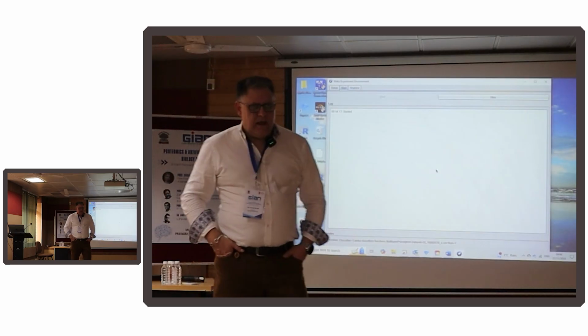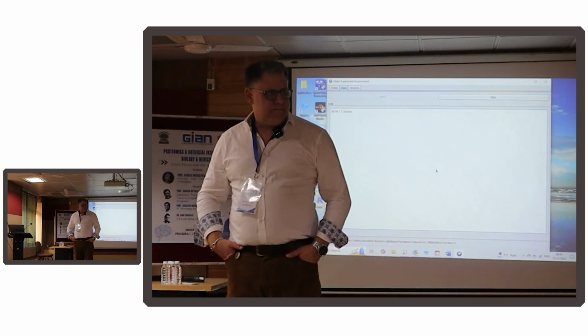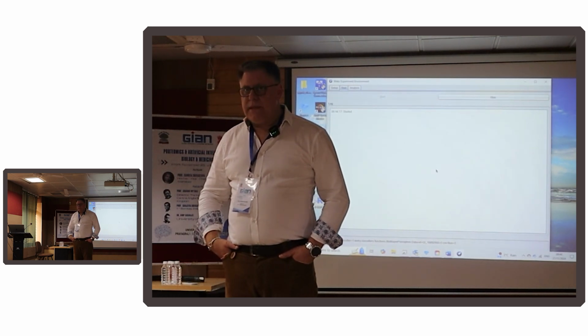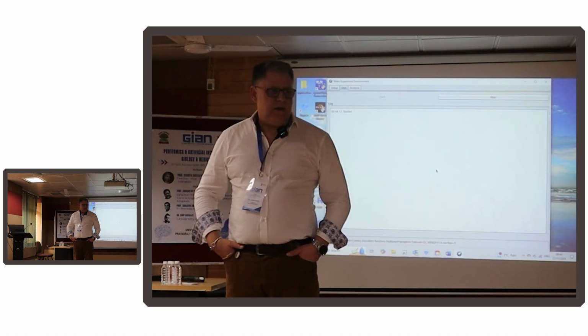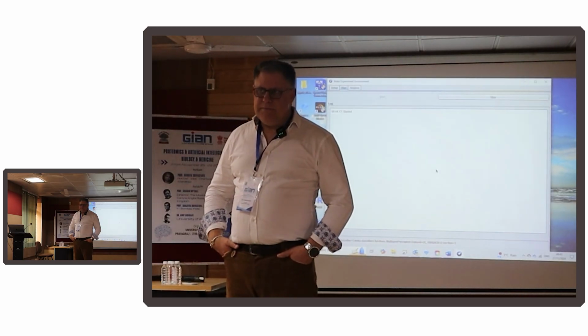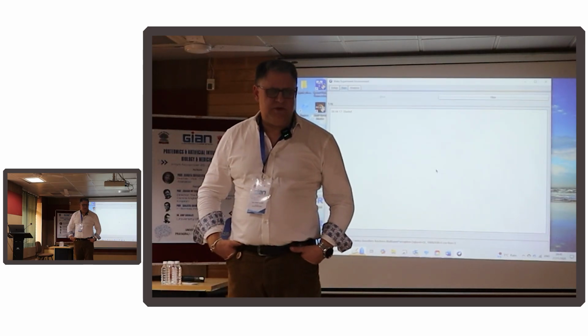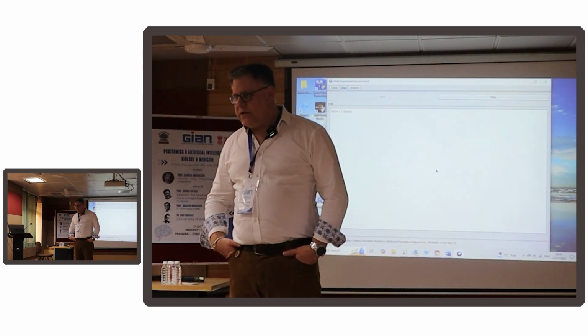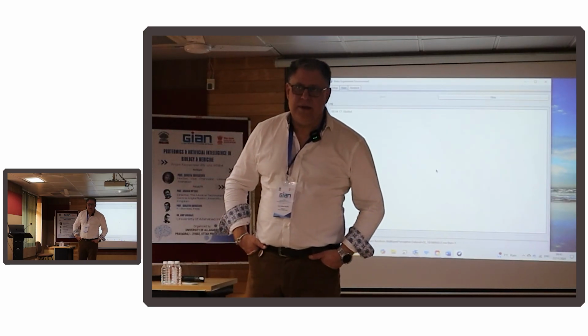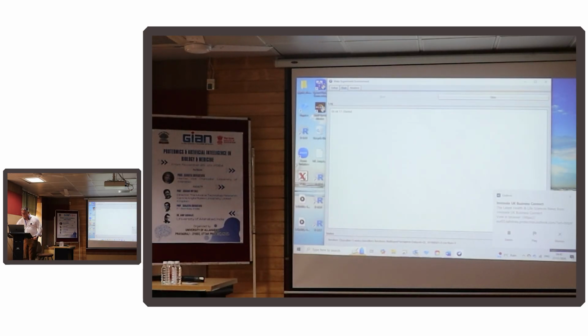So, are there any things you would like me to clarify on what you've seen so far? Have a go, have a play. You know, there's data in Weka for you to have a go with. Use that. You will learn how to do it. A lot of people use Weka and it will produce publication quality results because of the power of the algorithms that are embedded into it. So it is useful. Yeah, it's just running through now.